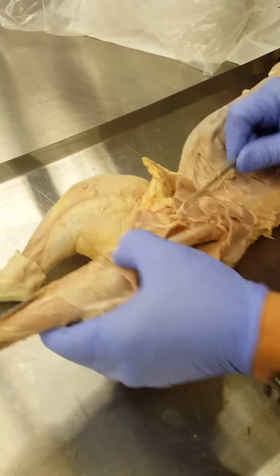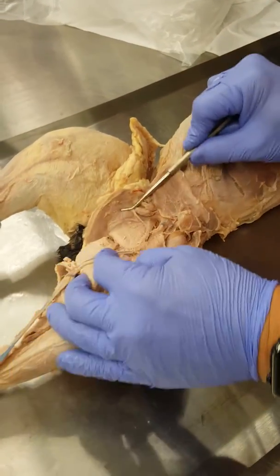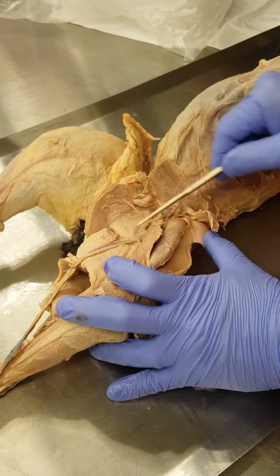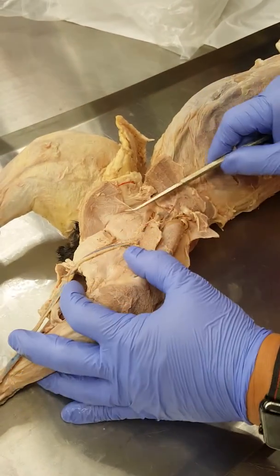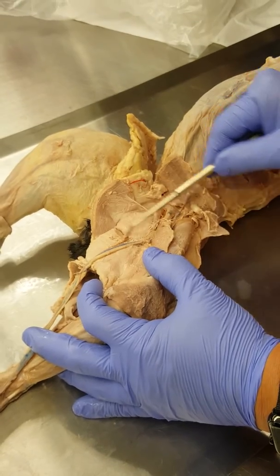Now, if we keep going to the medial side, right here, what you'll notice is this big triangle. We did not separate this out on our cats. So instead of doing adductor magnus, brevis, and longus, don't worry about that. All you have to do is tell me that this whole block right there is adductor. So this is all adductor right there.